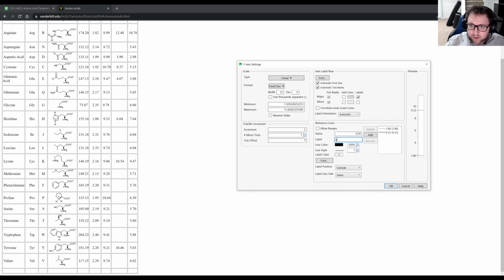And oh, look at that. We've got what looks like a little buffery region there. All right, and we can't see down that one. That's okay. That one's a little hard for us to detect just because of the fact that we used 0 pH HCl to adjust this. So it takes a long time to get there if we want to.